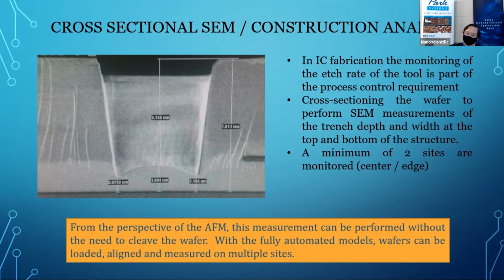Additionally, I can also look at the sidewall angles, which cannot be characterized on a SEM system. Moreover, the vertical height measured on the SEM is based on a scale. It is not physically measured. We empirically do this particular measurement against a SEM bar. The SEM is basically looking at only two dimensions, meaning the XY. The Z is not its key competency. Hence, this is one of the strengths of the AFM.